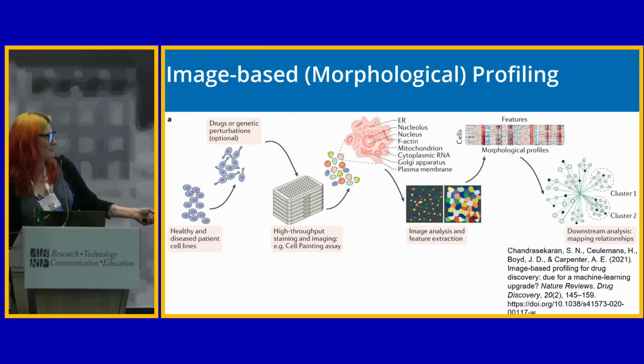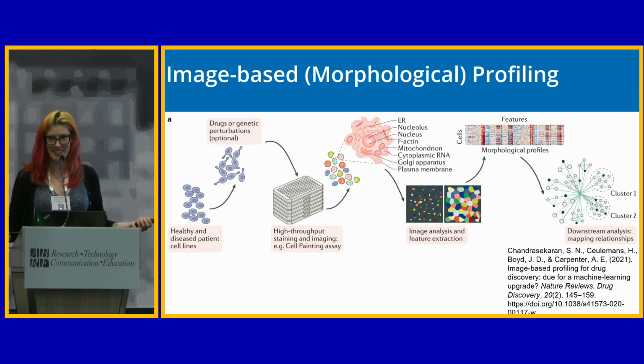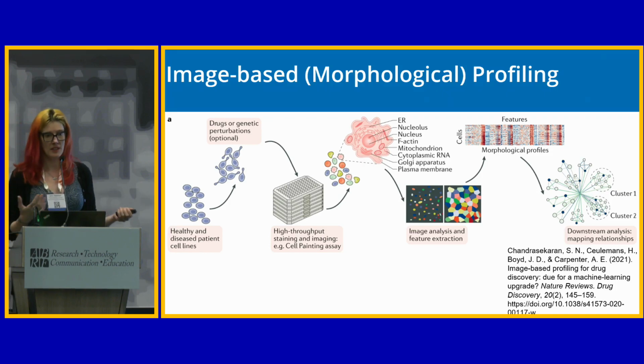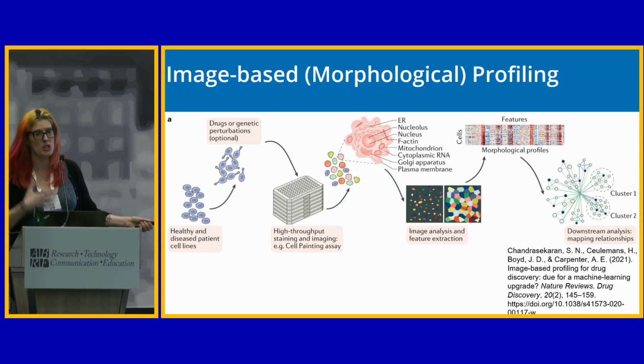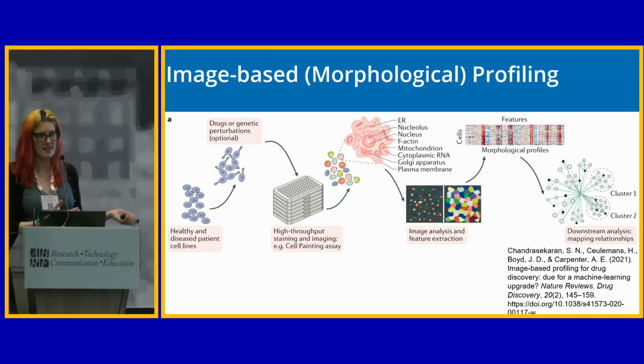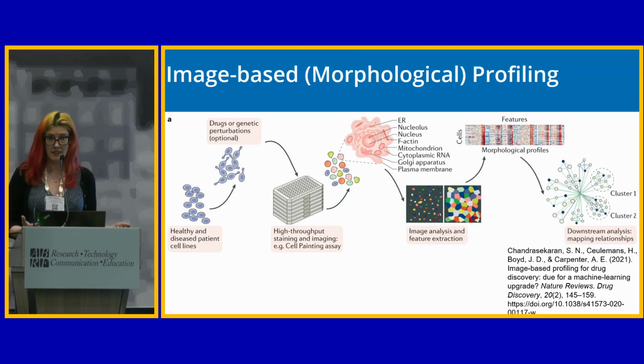So you may be very familiar with looking at sort of omics data, right? So in this parallel, each line I have is a single cell where I have a robust description. And rather than having gene expression, for example, a different gene along my columns, in this instance I have image features. And so you can get single cell data that is fully quantitative and an image-based profile that describes your quantitative image. And then you can do biology and ask questions.